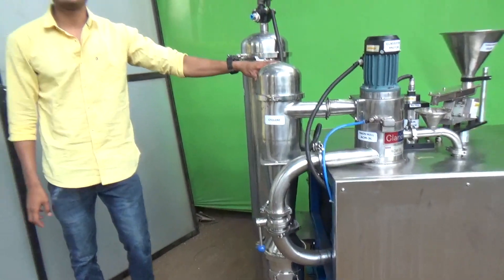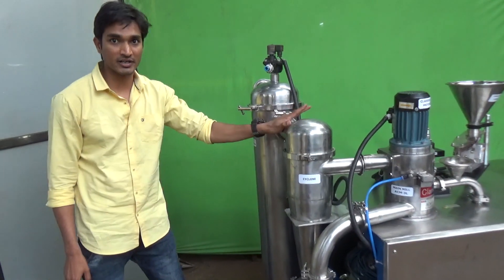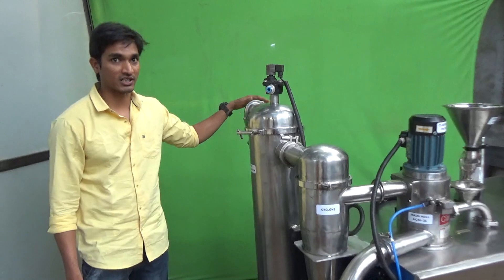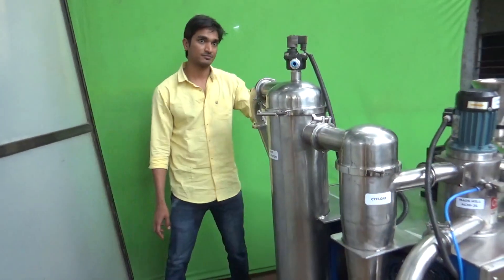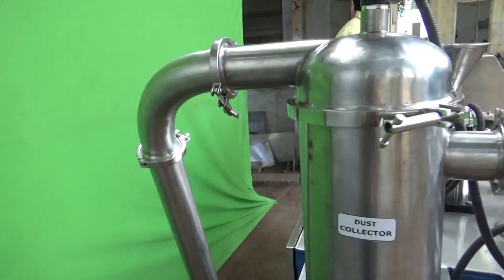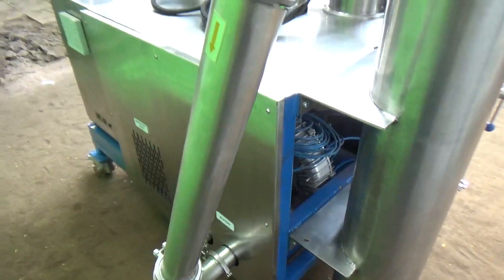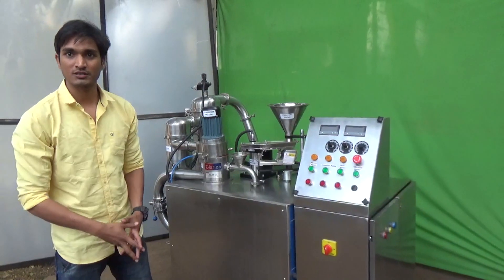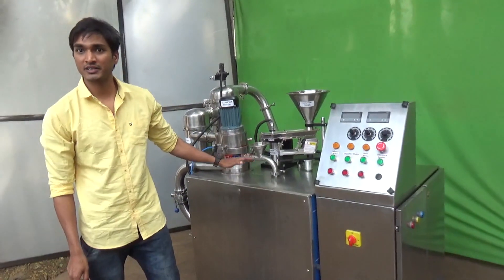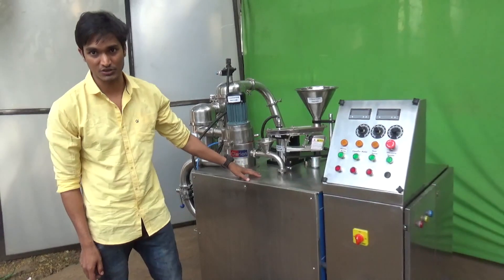The remaining air with very fine particles that are not required will be collected into the filter bag mounted over the collection drum. For suction, the blower is mounted inside the machine. To maintain the temperature of the machine and for the motor, the radiator is also mounted inside the machine itself.